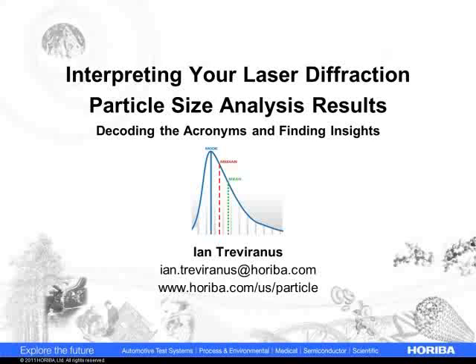I'm going to be speaking to you today for hopefully roughly 45 minutes about how you might interpret your laser diffraction particle size results. It's a very wordy title, and there's certainly a lot of different things we can do here, but I'm just going to touch briefly on a few topics.